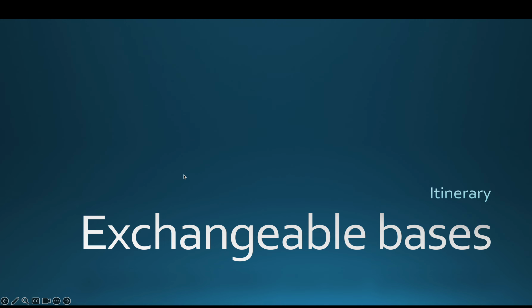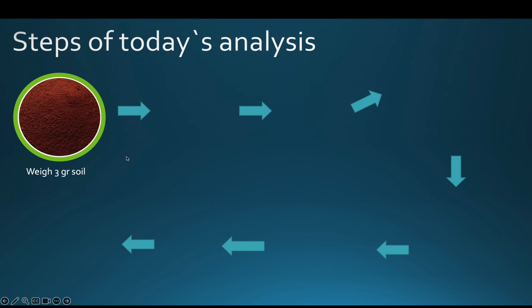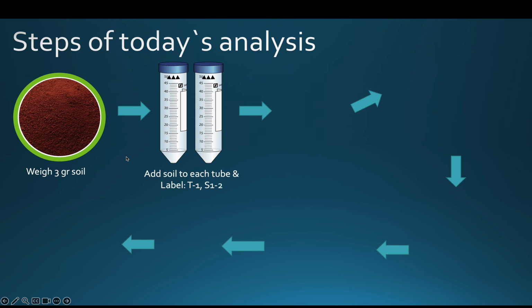First little batch here, this would have been the first of our two soil shaking labs. To this point, we weighed out some soil of a known mass, hopefully at a pretty accurate basis. We labeled some test tubes with the different soils. If you recall, we're working with both a Hamlin and a Sparta.